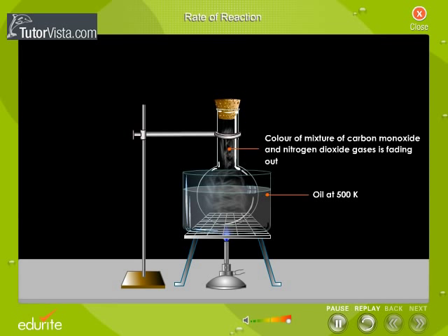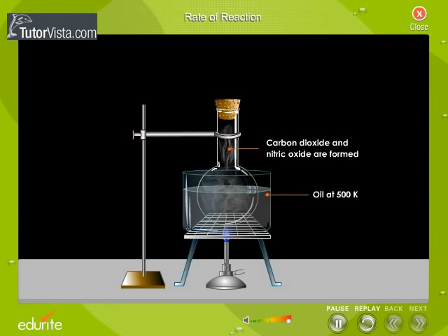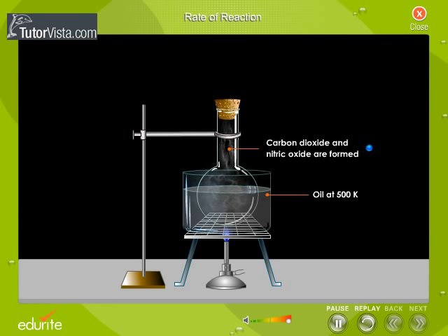Initially, when the gaseous mixture was at room temperature, it was dark brown in color, but when the flask is kept in an oil bath and heated gradually, the brown color fades. The carbon monoxide gas reacted with nitrogen dioxide, a brown colored gas. Carbon dioxide and nitric oxide, both colorless gases, are formed by this reaction. That is, carbon monoxide and nitrogen dioxide are consumed; at the same time carbon dioxide and nitric oxide are formed.